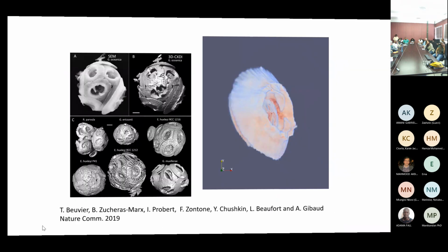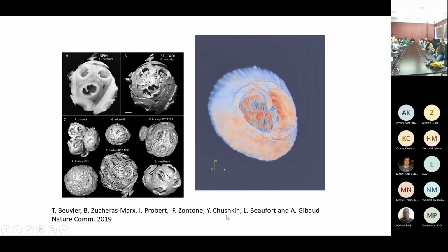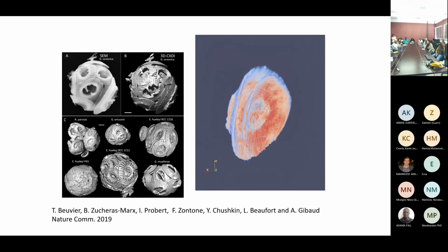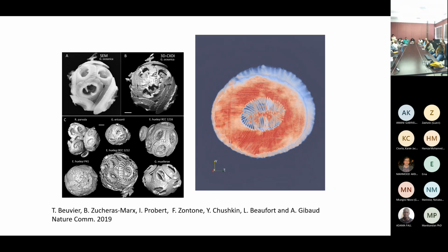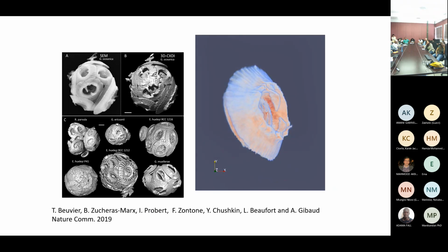And so in this case, well, you should start this one, or maybe I have to do it. You see, this is the coccolith, and look at the magnificence of this guy, with a very nice grid here of the order of a few nanometers, and we can completely isolate those coccoliths and measure them.